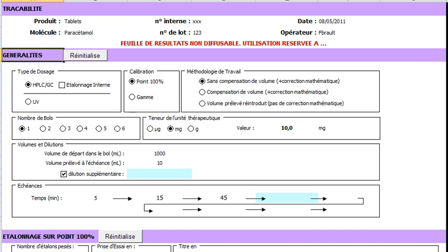Here we select whether the method is chromatographic or spectrometric. There is an option for the internal standard if you use one.